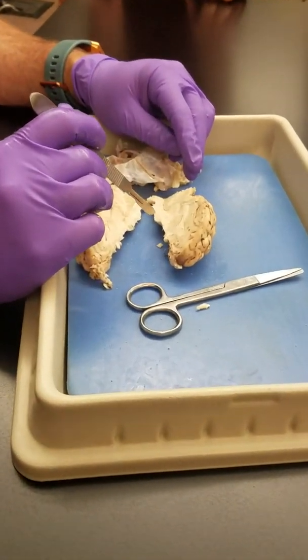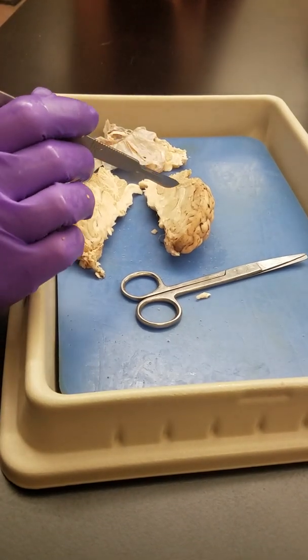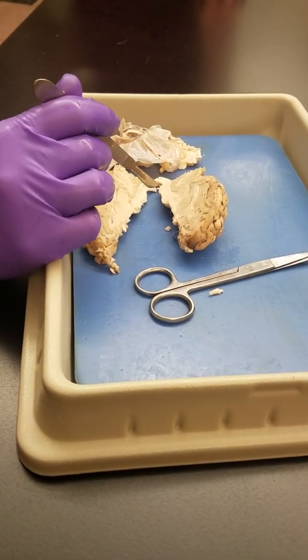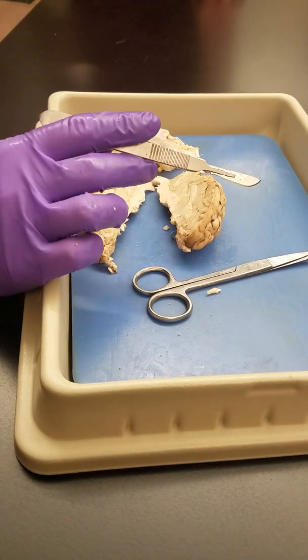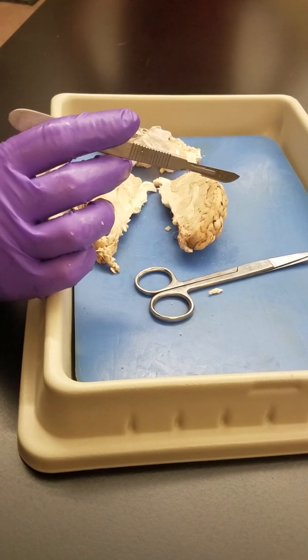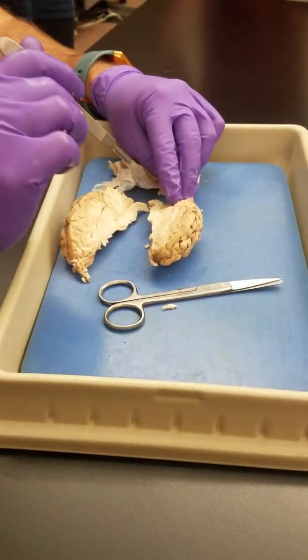Here you can see the pons and the medulla oblongata, and then here is the beginning of the brainstem. The pons and the medulla oblongata regulate the heart and the lungs. Even minute damage to either the pons or the medulla oblongata is going to cause nearly instantaneous death. For example, snipers are trained to shoot at the base of the skull. That's where the brainstem is. If you shoot through the base of the skull, the bullet's going to go immediately through the brainstem, and it's going to cause instantaneous lights out. Right? So they're not going to be able to do anything at that point. So any even slight damage to the brainstem is going to cause permanent damage.